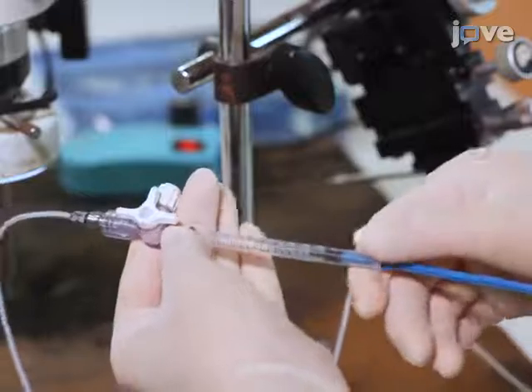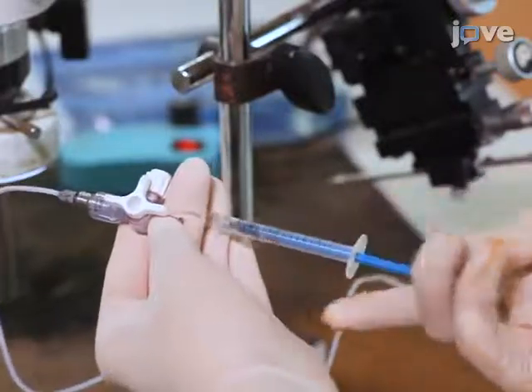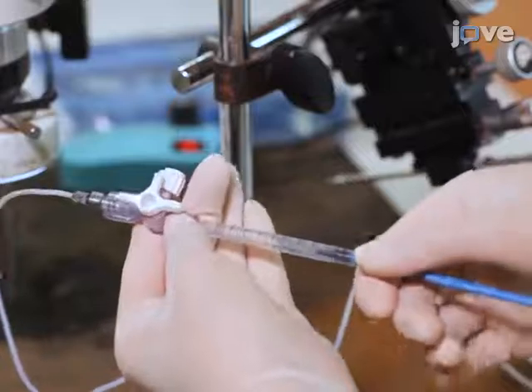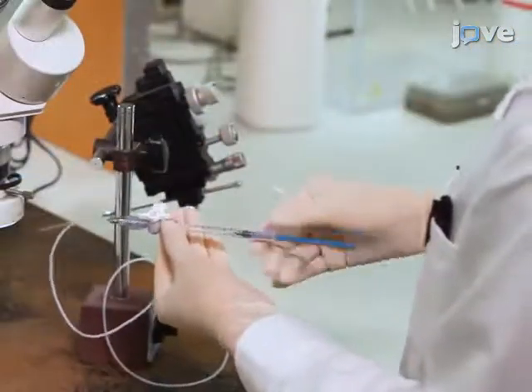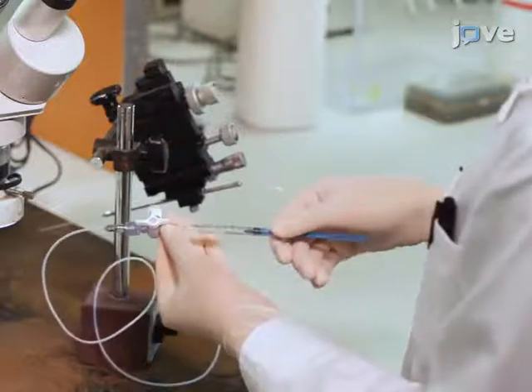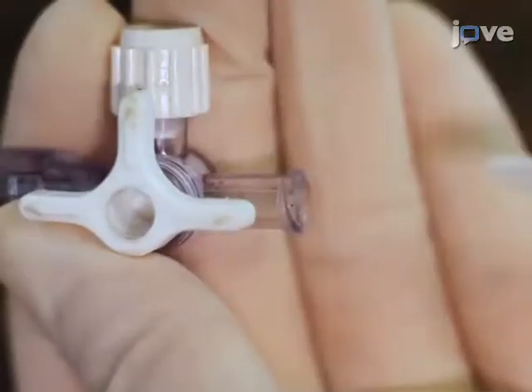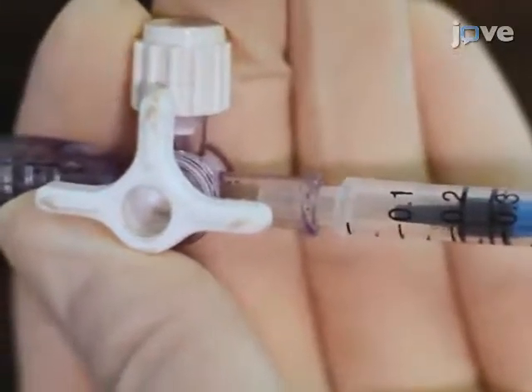Then plunge the syringe to expel any contaminants and create positive pressure in the capillary tube. Repeat this a few times by disconnecting and reconnecting the syringe to the three-way valve. Then draw up air to 100 to 200 microliters before the final reconnection of the syringe with the three-way valve.